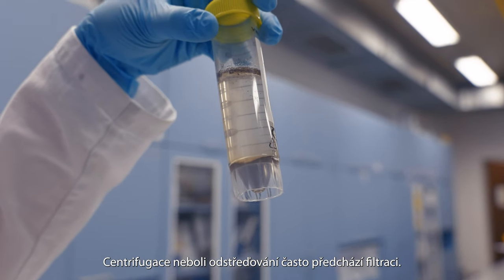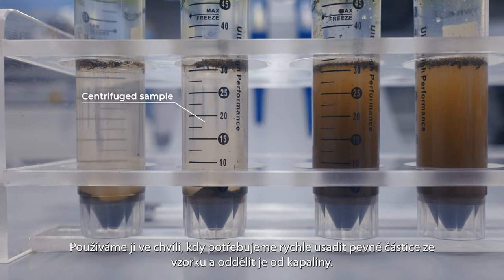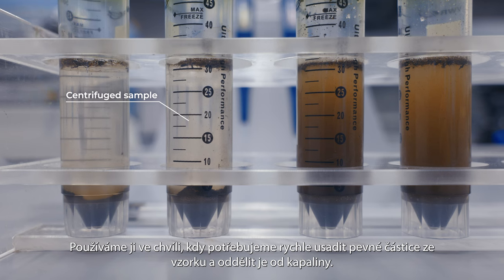Centrifugation is often performed before filtration. It is used when we need to quickly settle solid particles from the suspension and separate them from the liquid.